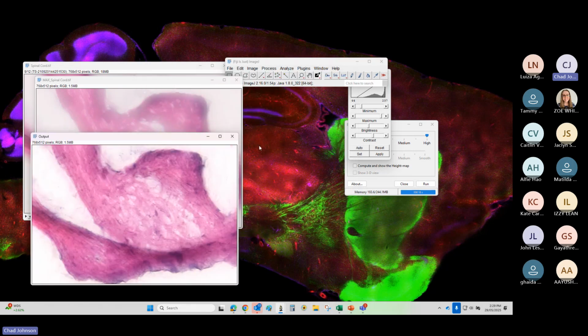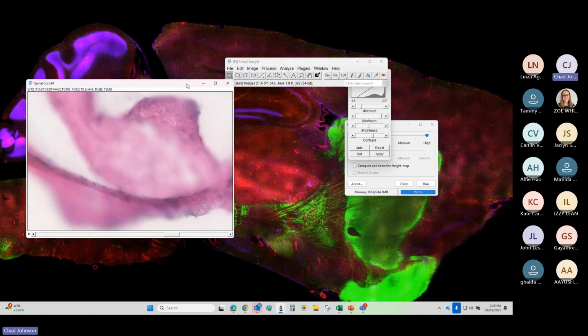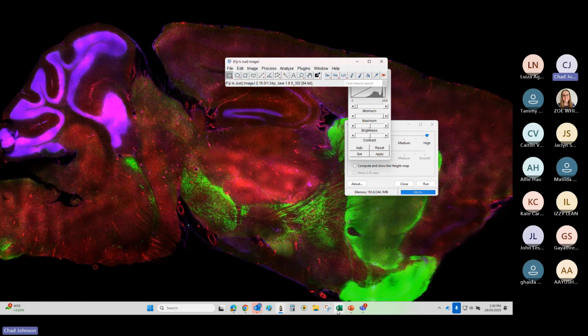Now, anyone who's used the Zeiss slide scanner, there is a functionality in the slide scanner that you can actually turn on EDF. It takes a larger amount of time to image because you have to do Z stacks on every single part of the image, but the images look amazing. So if you've got topography in your sample, and you need to get everything in focus, then EDF or EFI is the way to go.